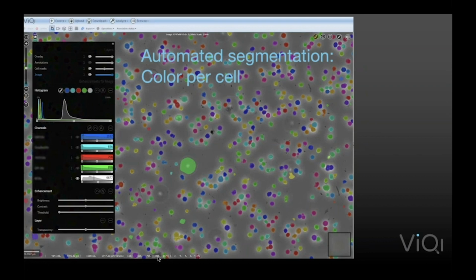So in the next slide, we can alternatively have a conventional image processing algorithm go and segment out all the cells for us, and then we would label them afterwards. And here, the colors are just showing us how the segmentation algorithm is separating cells. So cells that are close to each other, potentially touching, would have different colors assigned to them based on the cell ID, if you will. So those can be labeled also as an alternative path and sent to the AI.